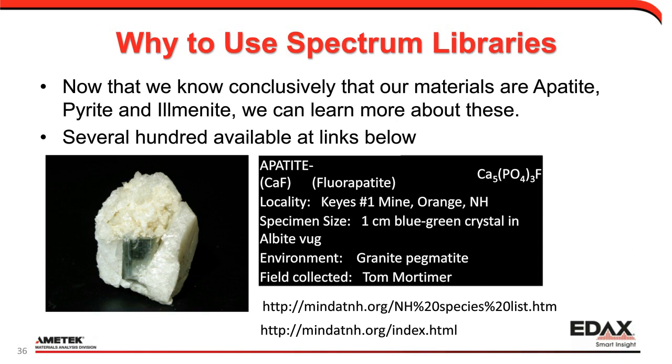So for those of you in the geological industry, you may have your own databases, but there are some really helpful databases out there. This particular one, I've been working with Tom Mortimer on his vast compilation of many materials, really hundreds of mineralogical and geological materials, and the details, the images, where it comes from, and what the compositional formula is, all available to us there. So once our spectrum library tells it what it is, the world is our internet searchable oyster for understanding truly what it is.